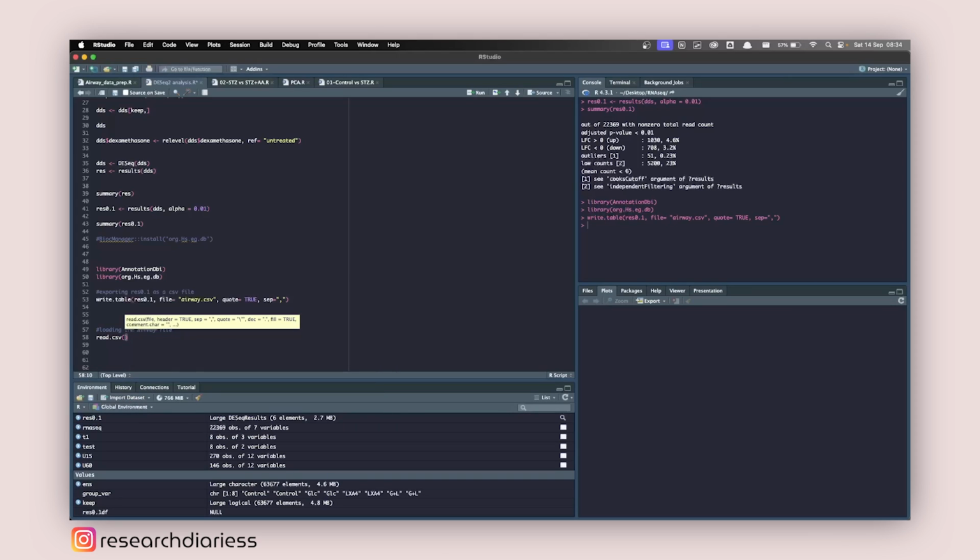Again, you have seen this in the previous videos. I'm going to put this inside a variable called RNAseq so that it's easy to call whatever we want. If I do Command Enter, it's loaded.